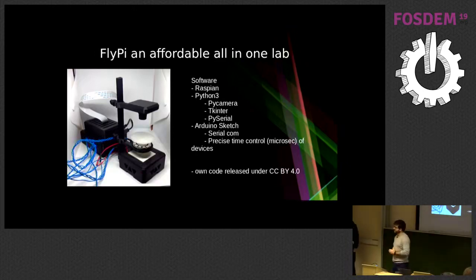Small question. You mentioned an SSH for image transfer. Why SSH? Why not multicast? Is it something about secrecy or reliability or what? Sorry. So the first question here was about the camera, which I forgot, and this is what I just talked about. And your question is why we want to use SSH and not some other protocol. Yeah, like multicast, for example, which a teacher could even use to follow an experiment. Right, so depending on the application, that's totally fine.